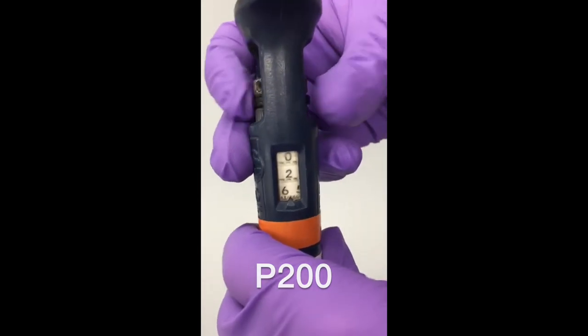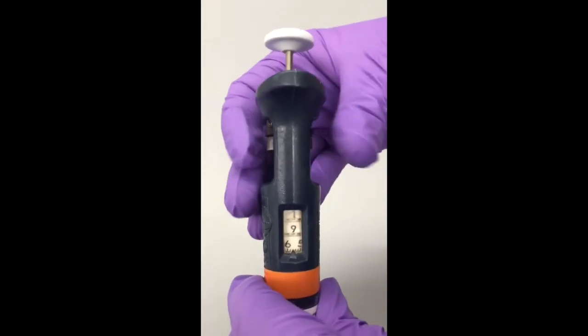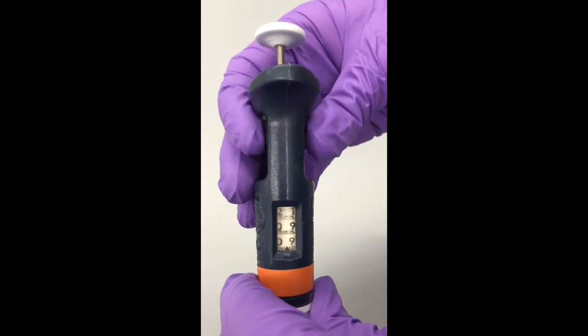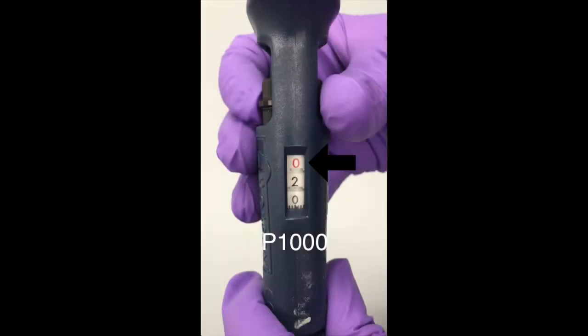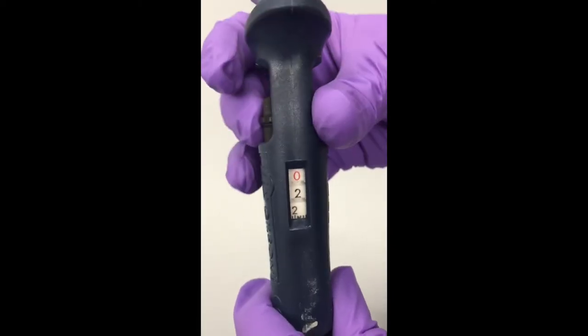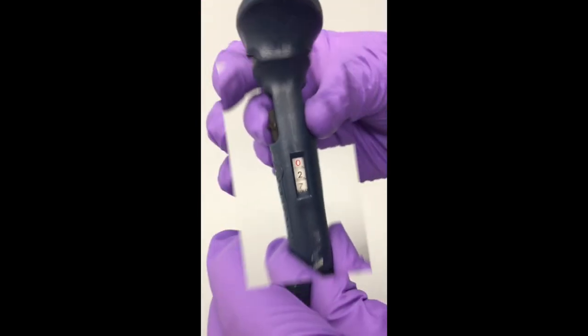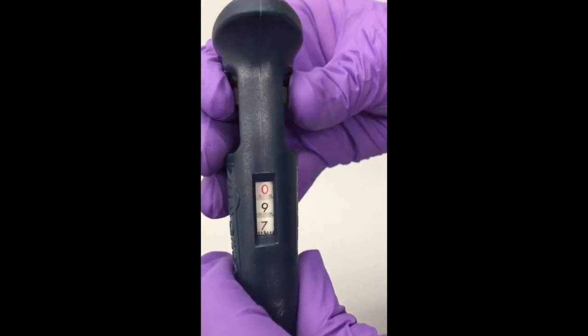The P200 is very easy and reads simply as is. For the P1000, the red number actually indicates the thousands place, so this number reads 200. As you turn the adjustment knob, the volume display increases by tens.